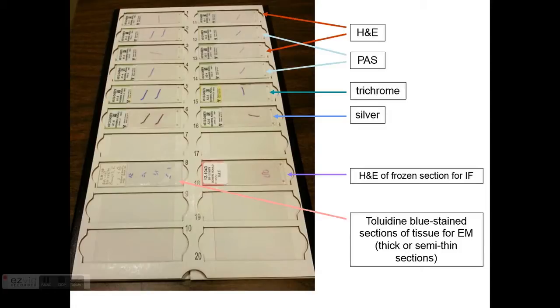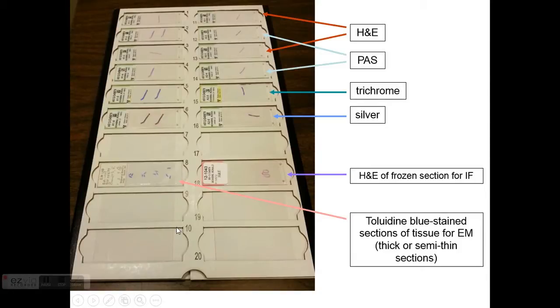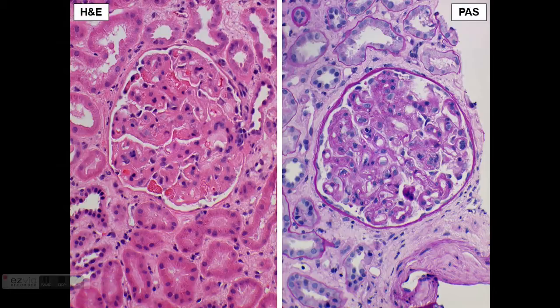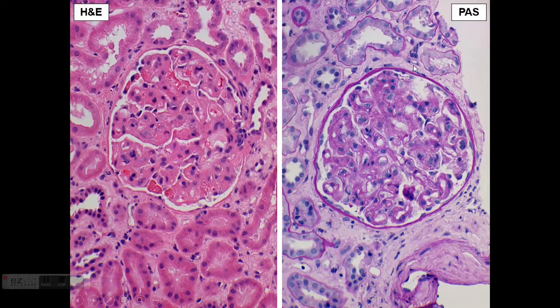Here you see a section stained with H&E. We can also stain tissue that went for immunofluorescence, and we can stain tissue going for electron microscopy with toluidine blue before putting it in the electron microscope. Because it's embedded in very hard plastic rather than paraffin, it stains best with toluidine blue. H&E highlights the cellular component and is the bottom-line stain in general pathology, but for kidney pathology we rely heavily on PAS and silver stain for better architectural detail.